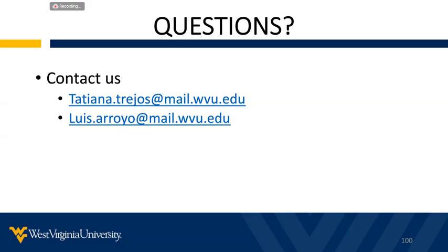For the organic portion of the LCMS, what we have used are the neat standard solutions and mixtures, and then of course authentic samples to corroborate. So when we have an LCMS result for organic, we corroborate that with electrochemistry and vice versa.